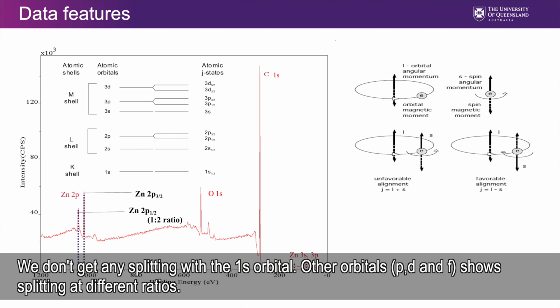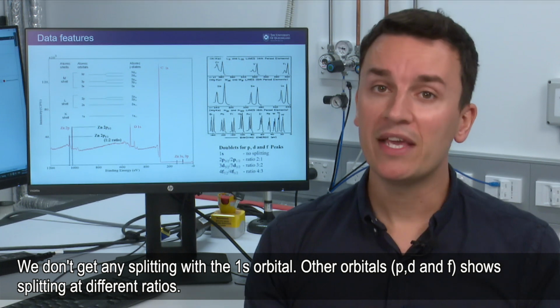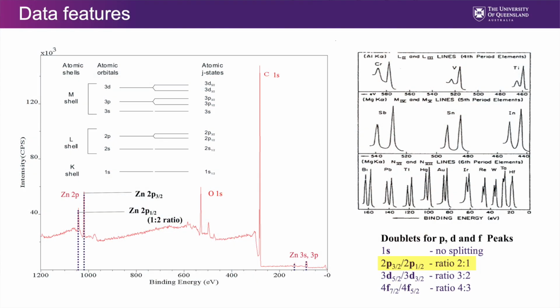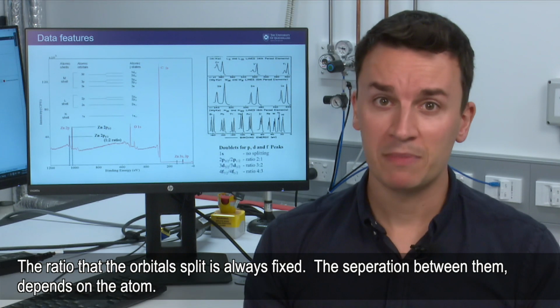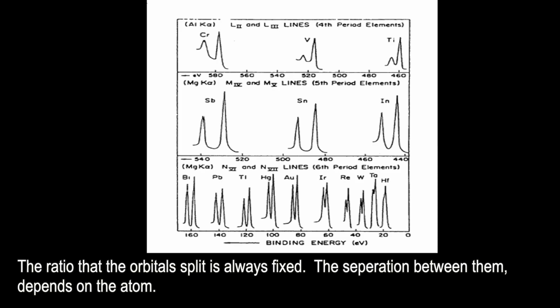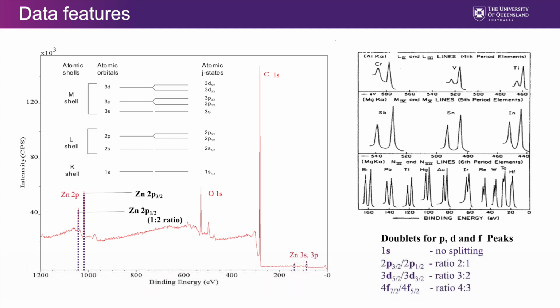We can go through all of the orbitals. We don't get any splitting for the s orbital, but for the p, the d and the f, we get a splitting. And these always appear at a particular ratio. For example, the p orbitals always split at a ratio of 2 to 1. The d orbitals always split at a ratio of 3 to 2, and the f orbitals always split at a ratio of 4 to 3. The ratio that the orbitals split is always fixed. However, the separation between them depends on the atom. This is atom specific, but the ratio is always constant.